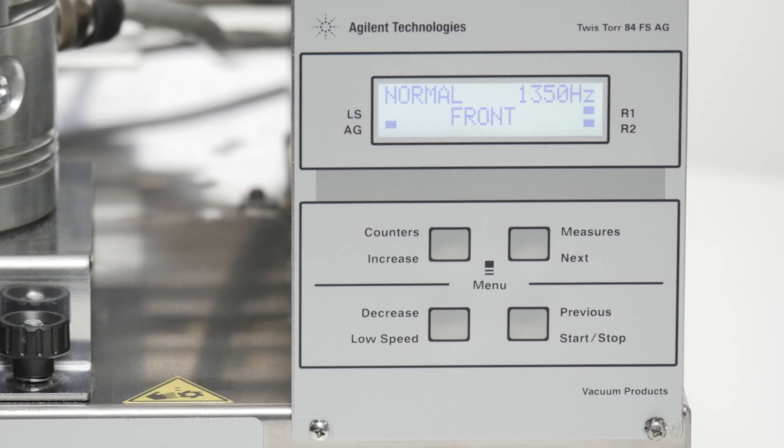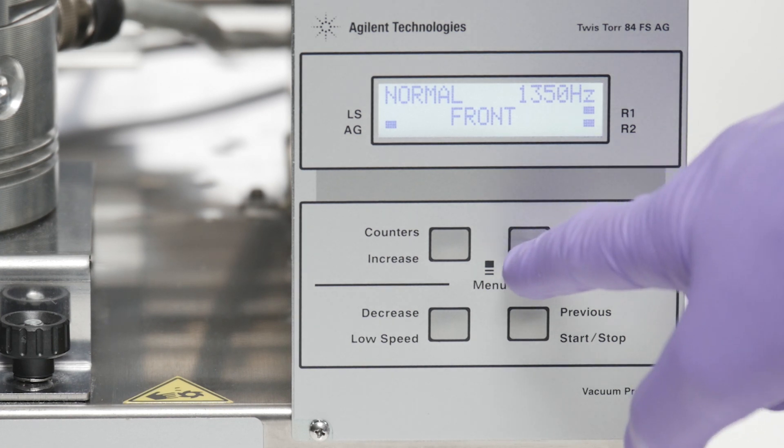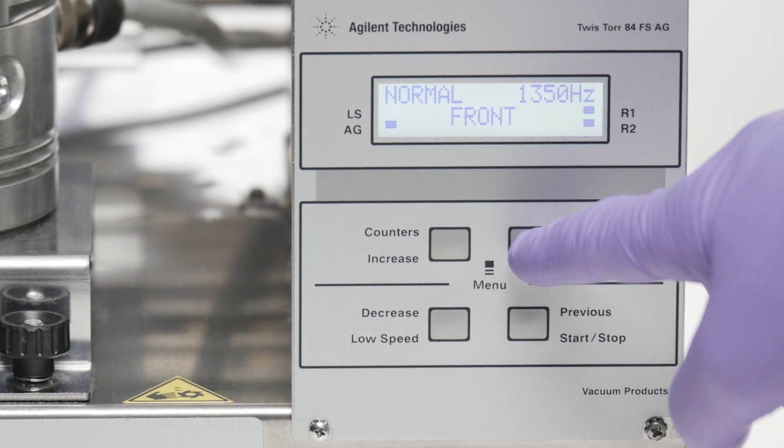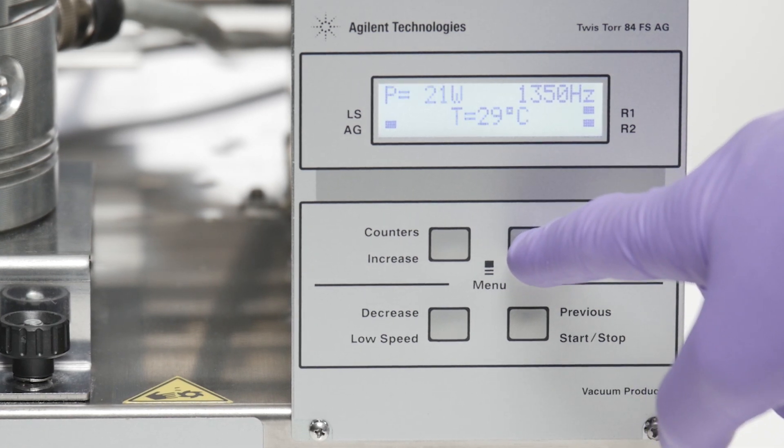With our turbo pump operating at full speed and in normal conditions without a gas load, we can see that the parameters look very typical.